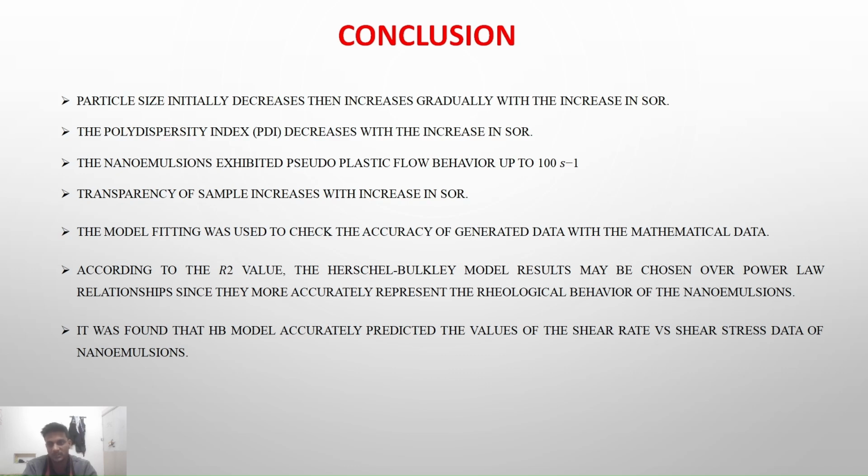Also the polydispersity index decreases with increase in SOR. The nanoemulsion exhibited pseudoplastic flow behavior up to a shear rate of 100 per second. And the transparency was a visual representation. It was seen by the naked eye that the transparency of the sample increases with increase in SOR.